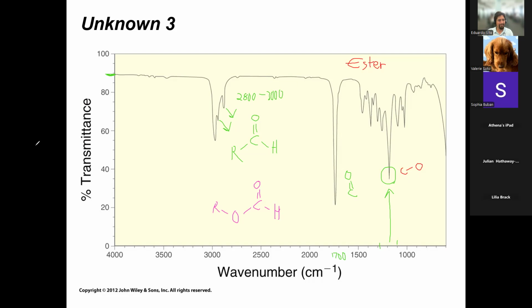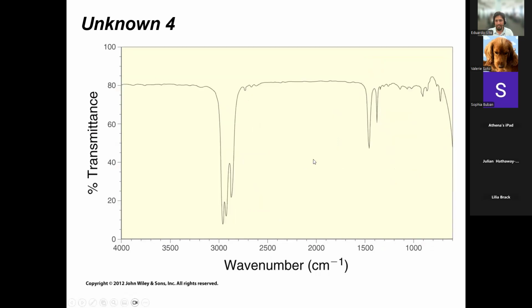All right. And let's see. One more here. All righty. Again, pretty simple spectra. Do we see carbonyls? Yes or no? Anything at 1700? Either we do or we don't. No, exactly. Right? No carbonyls at 1700.